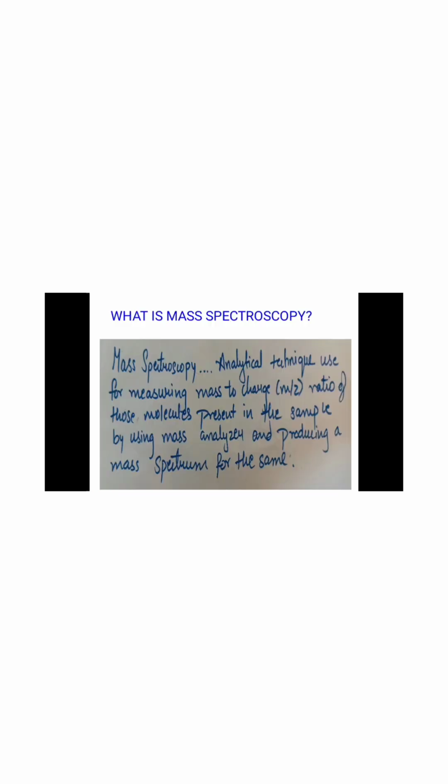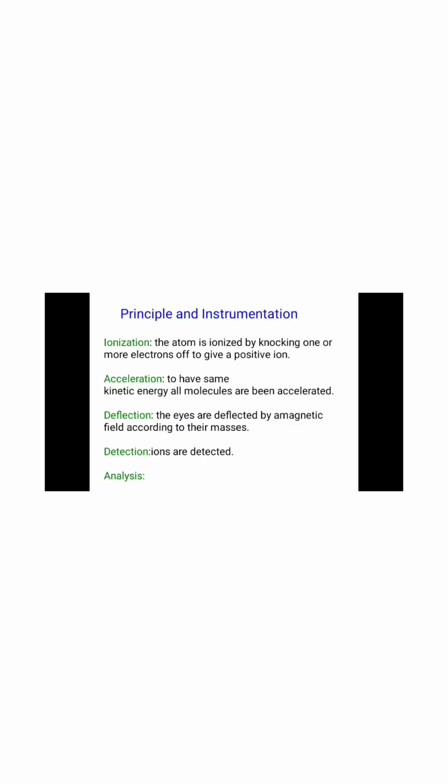Now today we are going to see an interesting topic, that is mass spectroscopy. So basically, what is mass spectroscopy? When we hear this word, what comes into our mind? It is an analytical technique that measures the m by z, that is mass to charge ratio of the molecules using a mass analyzer and produces a mass spectrum for the same.